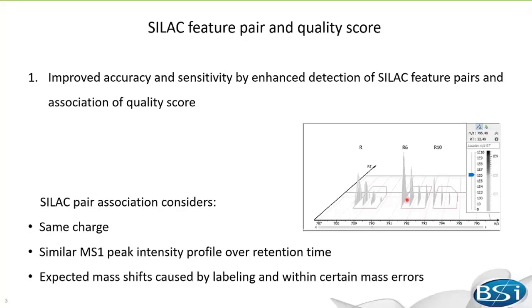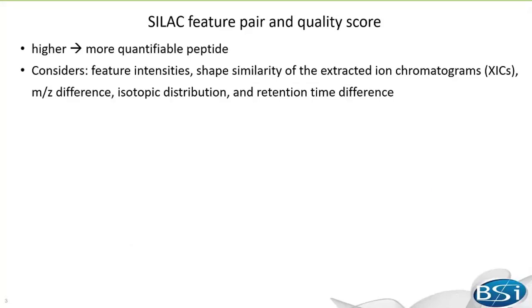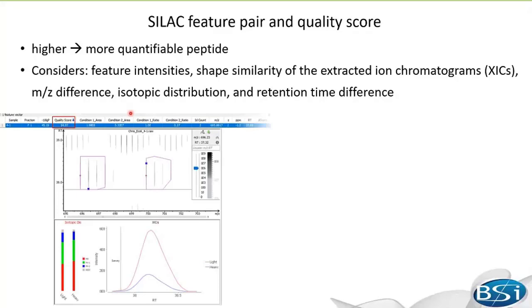The higher the quality score, the more quantifiable the peptide is. I'm going to show you three SILAC feature pairs assigned with high, medium, and low quality scores. The first feature pair has a quality score of 95, which is a good example. You can tell from this figure that this pair has relatively high intensities and a similar elution profile.